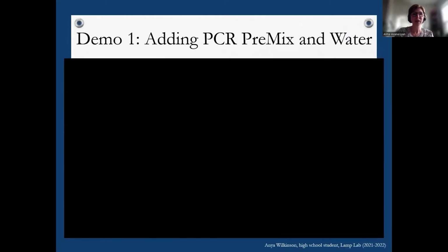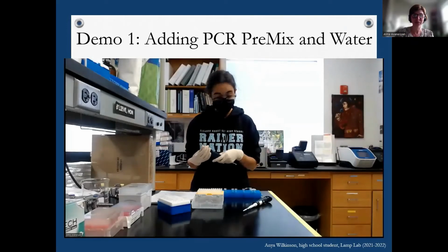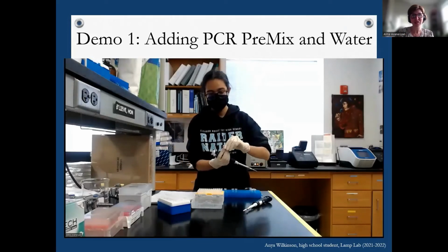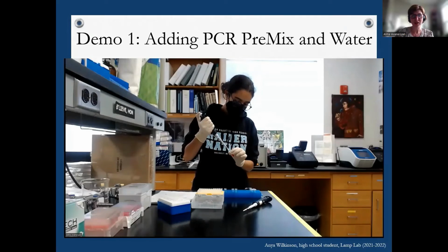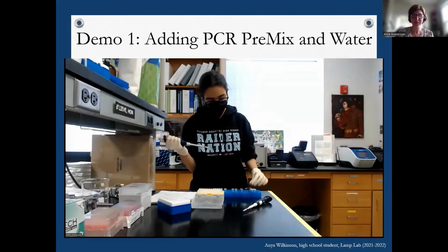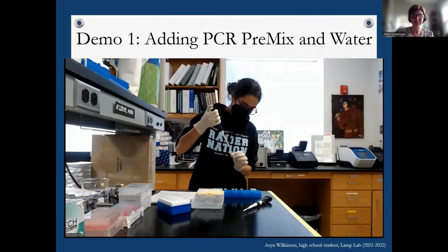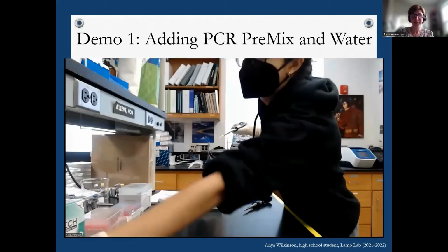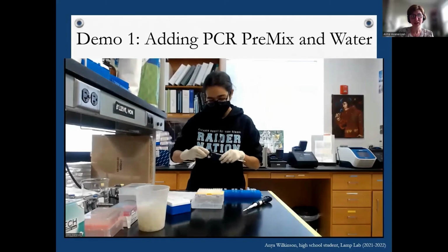In this demo, you can see the first step, which is adding the PCR premix and water. In this video, Anya prepares 3 reactions for 2 samples. As you can see, PCR premix goes first in the tube. And then the water should be added. Every time we need to change the pipette tip. And every time you add a new reagent, you mix it by vortexing.